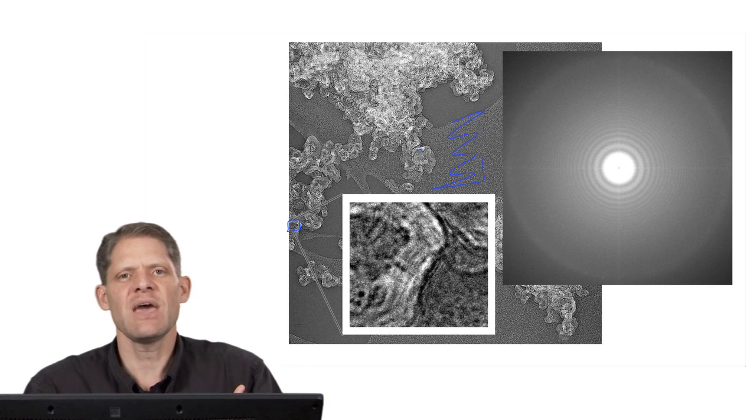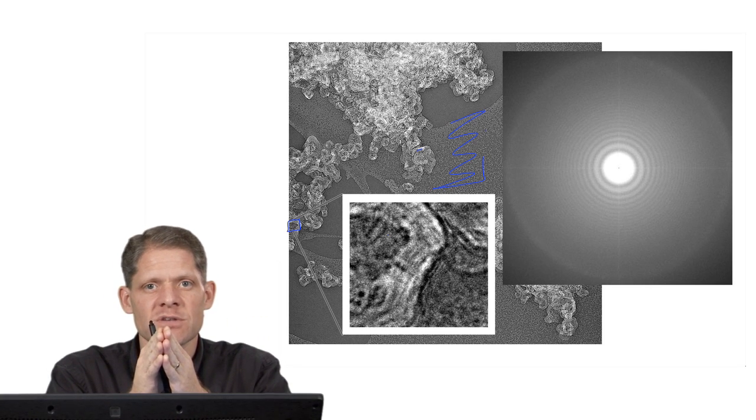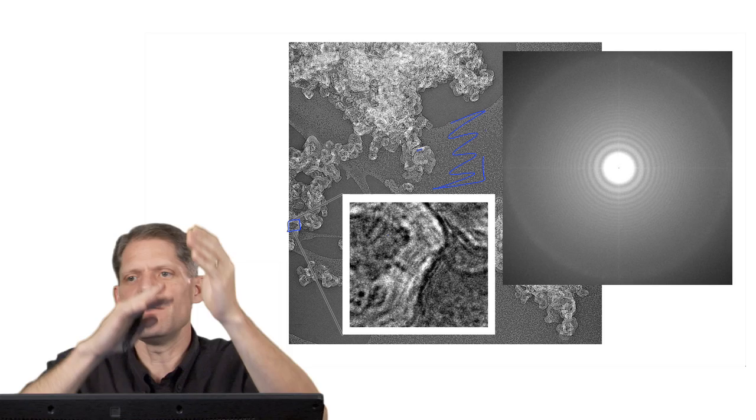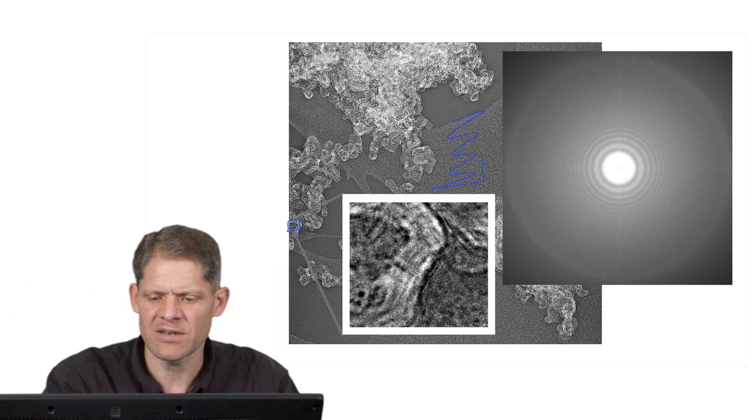And so it produces a sample with these very fine 3 angstrom layers in stacks in many different orientations across the grid. As you can see, the graphite is bent up into many different possible orientations.